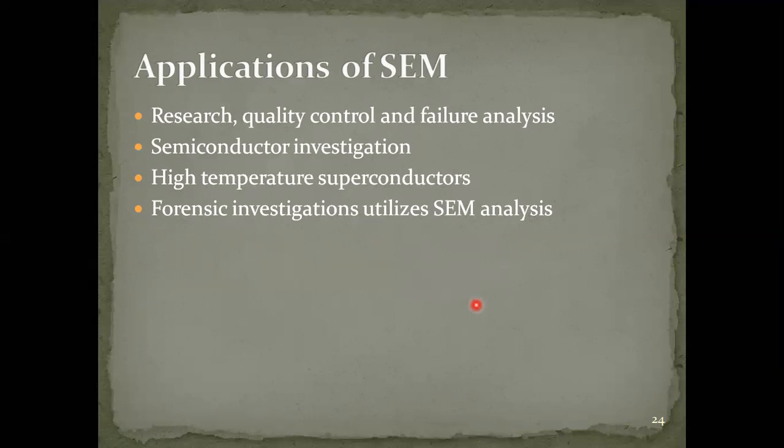Do you rely only on XRD, or on energy dispersive analysis of X-rays, EDAX? By using that, we can find out the chemical composition: how much copper is present in your material, how much sulfur is present, and whether apart from copper and sulfur some other contaminants are there. That is normally attached to FE-SEM with EDAX or SEM with EDAX.